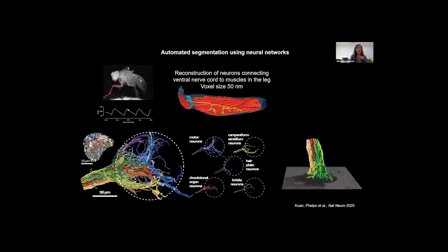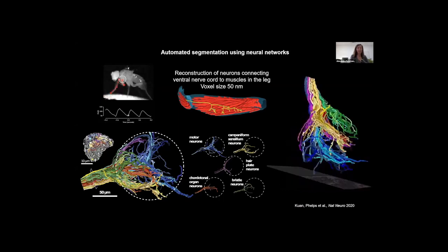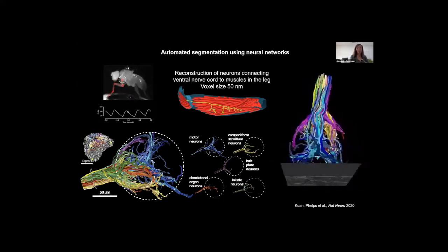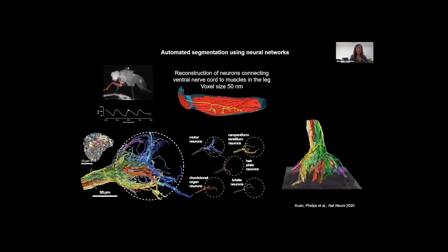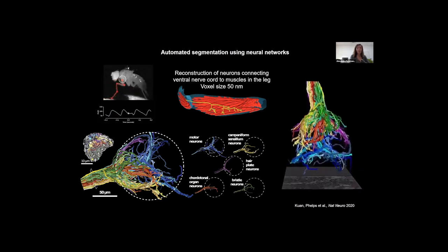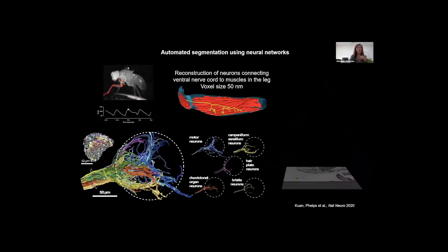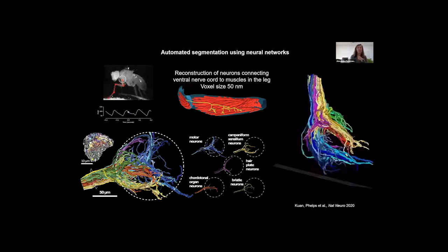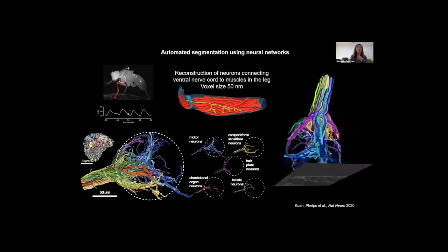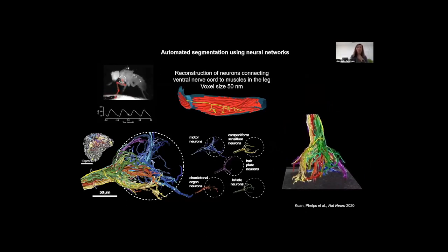And then this is just a small parenthesis: of course, this is very, very large and complex data. In order to reach knowledge, you usually need to segment. So the data analysis is really important. And luckily, there are now a lot of teams that work on automatic segmentation based on machine learning, and things are starting to be more promising that one day we're going to be able to obtain the segmented data without years of manual work, or without having the infrastructure of Google for computing.